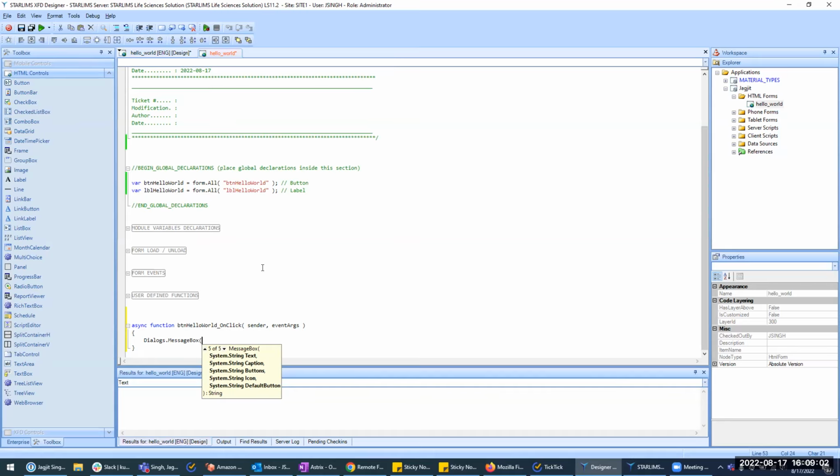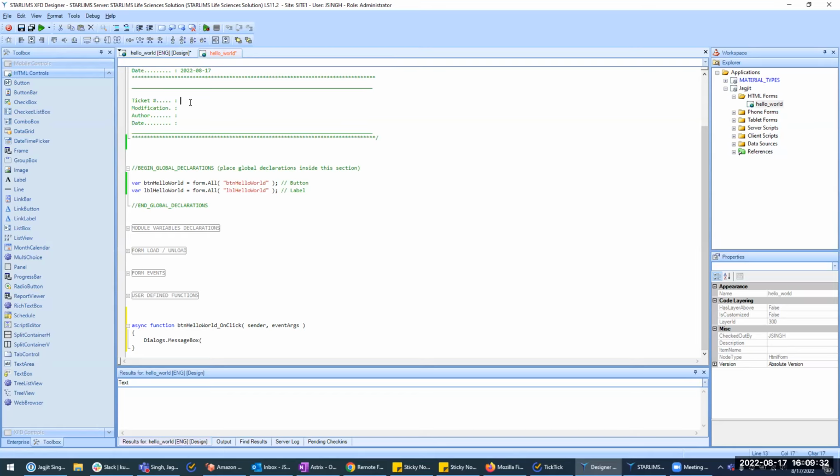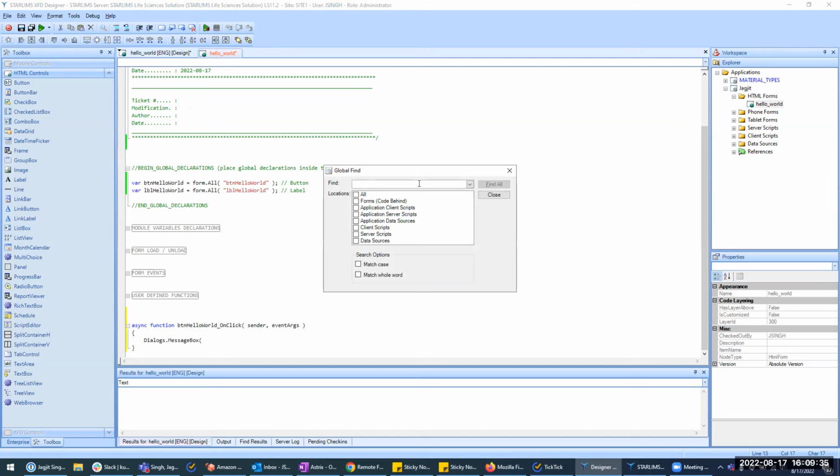about the dialogues message box, I would grab that text that he has there. So, no, the actual text where the cursor is. Yeah, just like this. Copy that. Yeah, all the way to the beginning. Copy it. And then go to, I think it's tools at the top. Global find, or look for it: Control Shift F on the keyboard. There you go. So it's somewhere in the toolbar, but I know it from shortcuts.